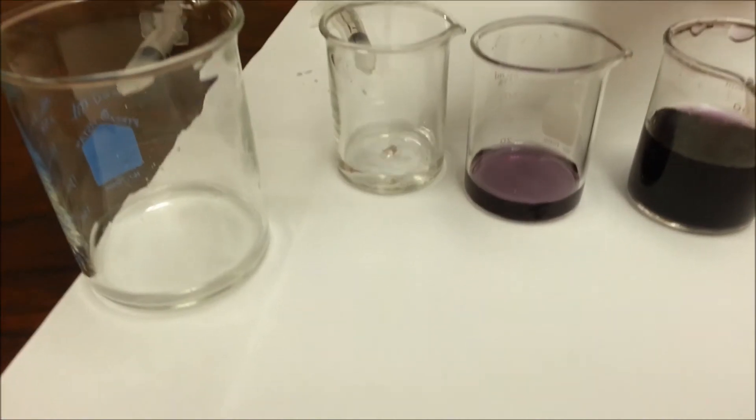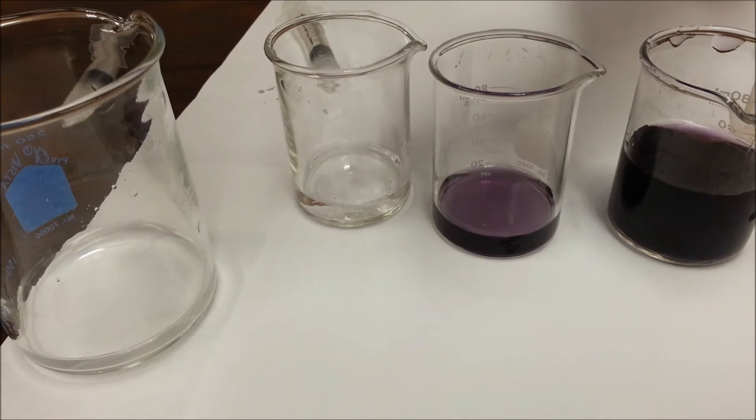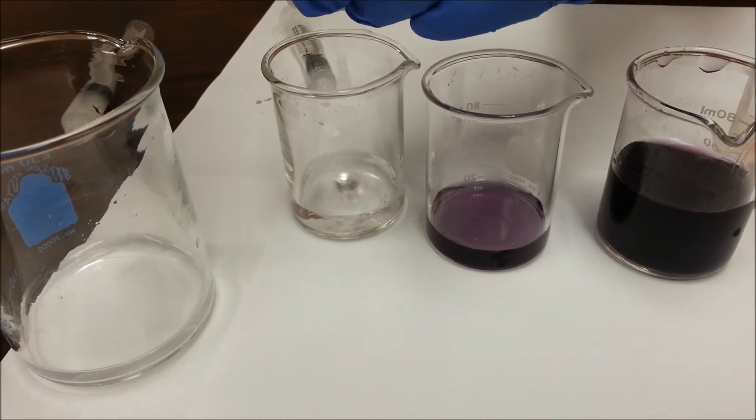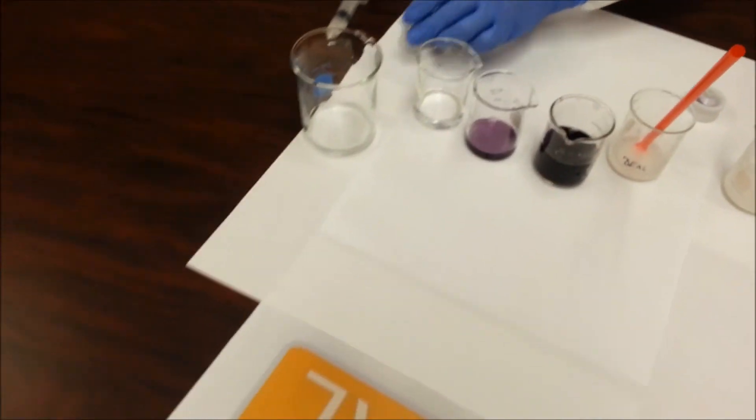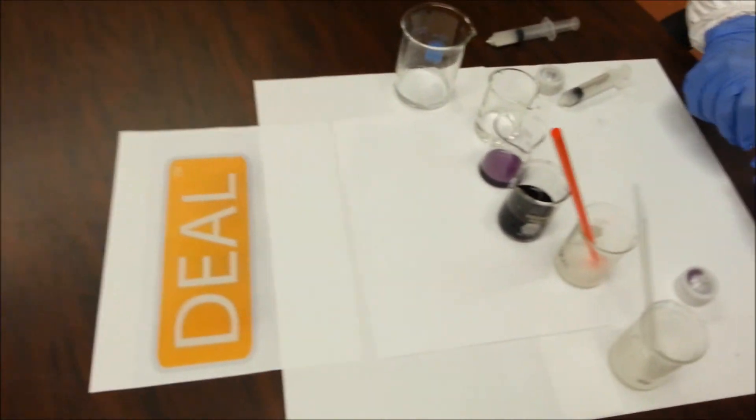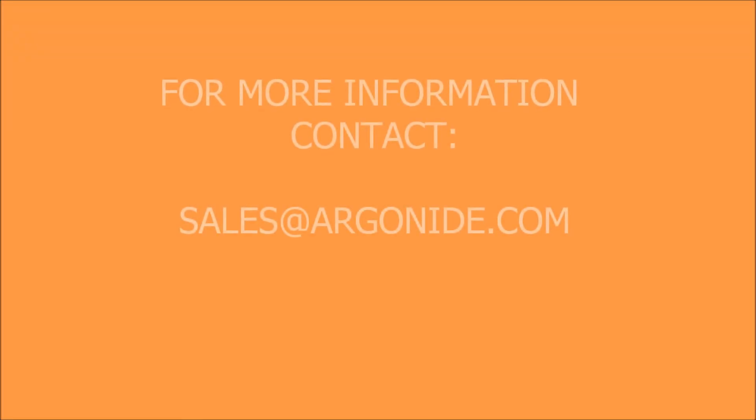And as you can see, the color is not coming through at all. It's absolutely clear. That is the demonstration for DEAL. Thank you very much.